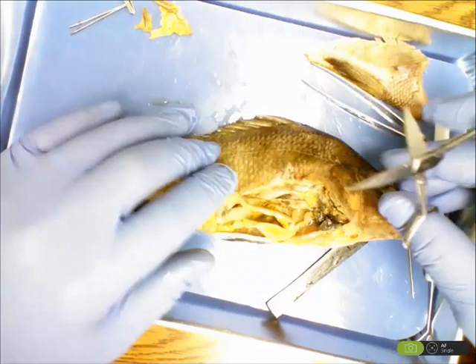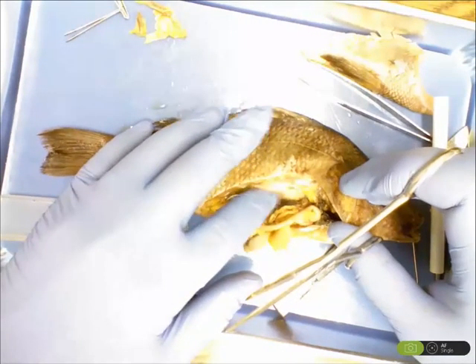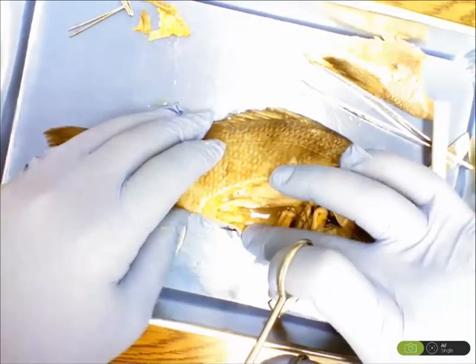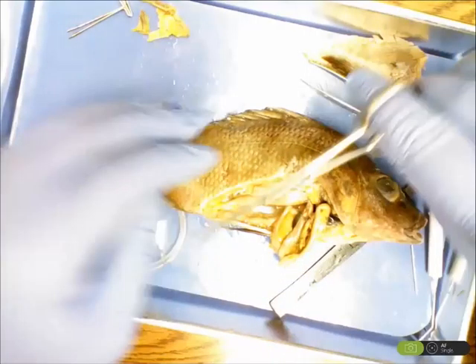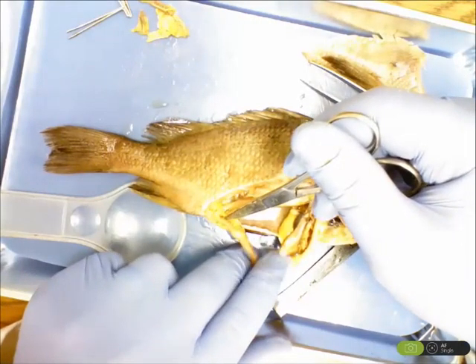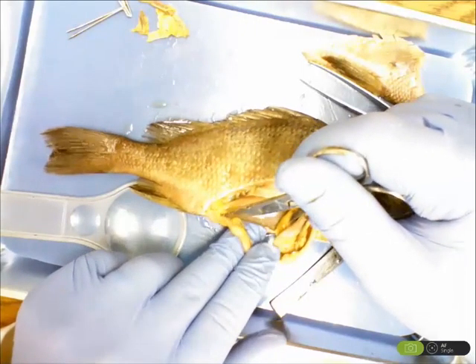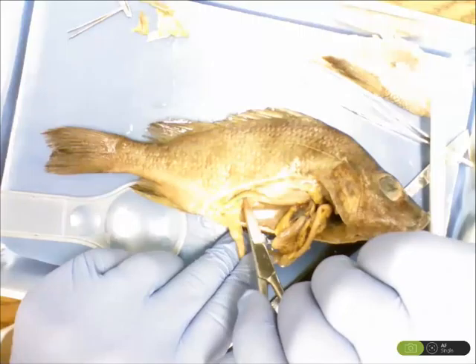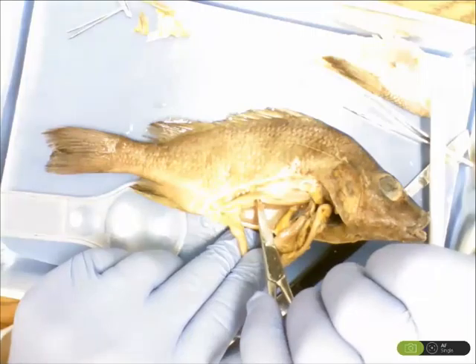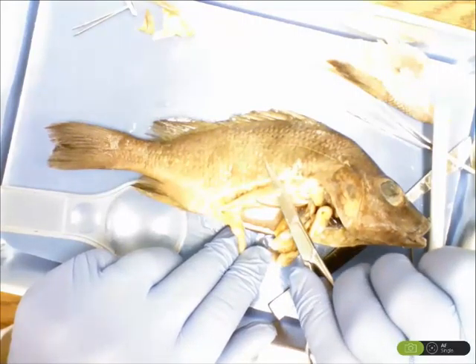The ovaries, or the testes, those are created inside of the gonads. And probably the easiest way to find the gonads is to go back to the anus, and slightly above where the digestive system leaves the body, there's another set of long filaments or tubes that kind of come out of that same area. These are the gonads. They should be slightly to the dorsal side of where the digestive system spills out.